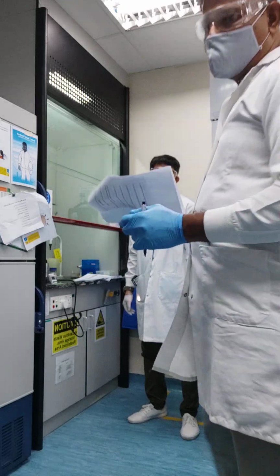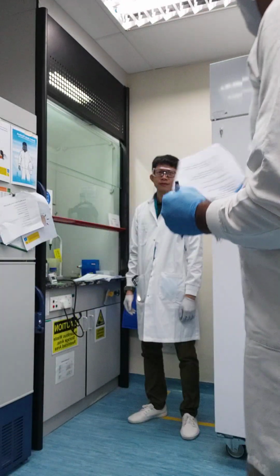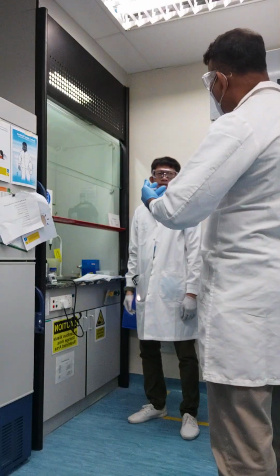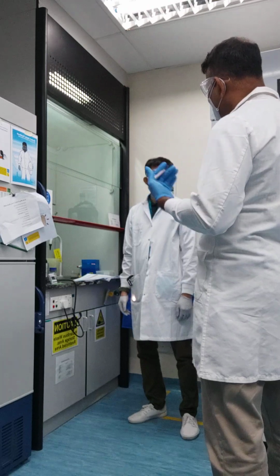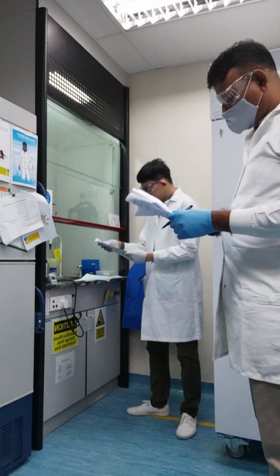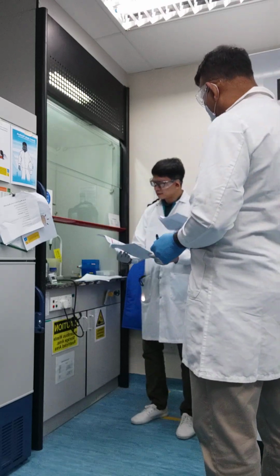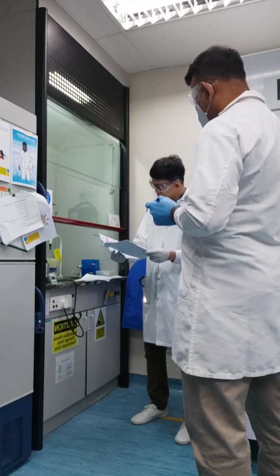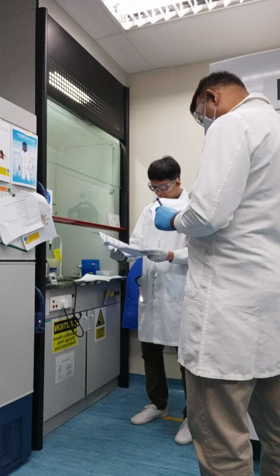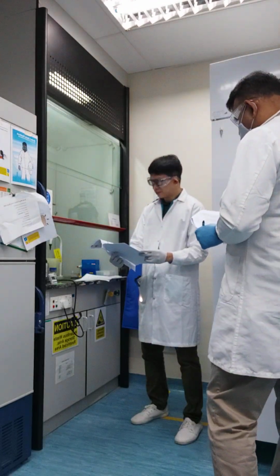Do you know which sections of the safety data sheet you need to refer to, to understand the hazards and how to prevent accidental exposure? Let me check. I need to look at the hazards section, the composition, the first aid, firefighting, accidental release, storage and handling, and PPE.